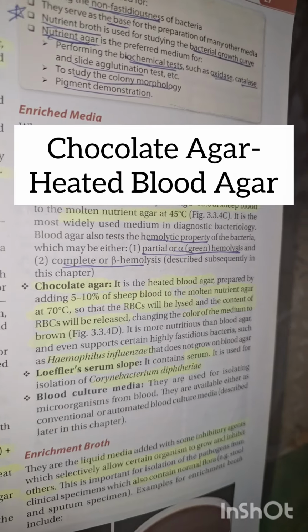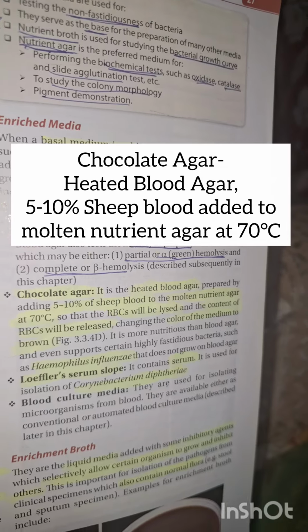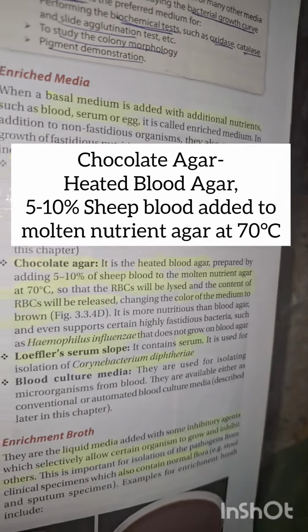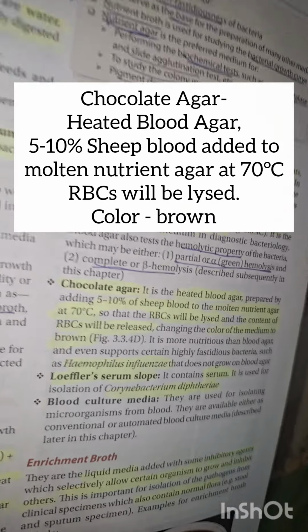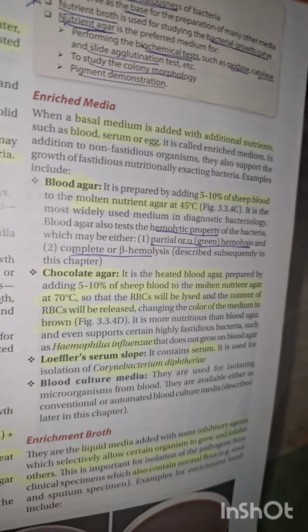Then comes the chocolate agar. Chocolate agar is a heated blood agar prepared by adding 5 to 10% of sheep blood to molten nutrient agar at 70 degrees Celsius. At this temperature, the RBCs will be lysed and the content of RBCs will be released, making the color of the media brown. In blood agar, RBCs are intact, but in chocolate agar, RBCs are lysed.